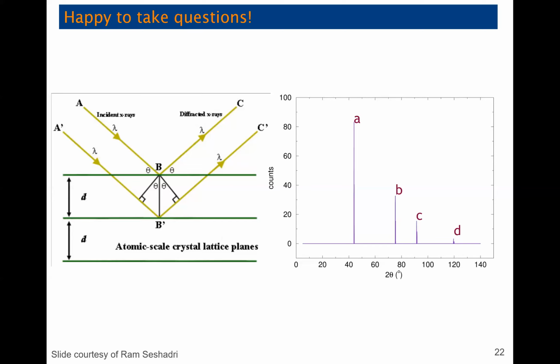Since we know exactly what they are, and otherwise it's transparent to X-rays, the X-rays can go through, look at your cathode material, and bounce back out. From the final pattern we get, it's pretty easy to subtract out the beryllium peaks, so you can see what's happening just in your material. That's how one would do it. We're still working on fixing our operando cell here, but yes.